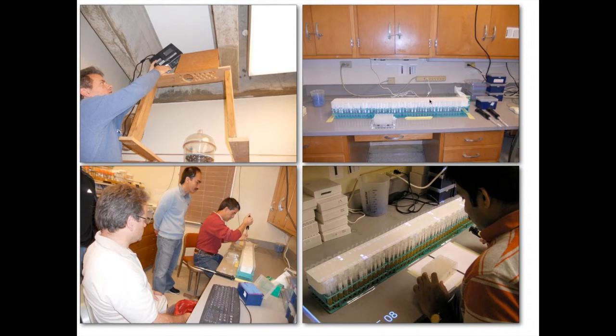This is a side-on view of the 91 receptacle tubes laid out in two rows on a rack and the plate with the source materials. Here's again the work area with the lights shining down, matching up with the receptacle pools so the pooler can see where to pipette.